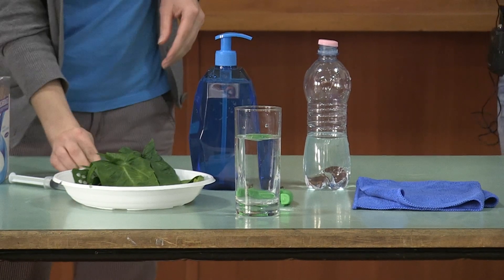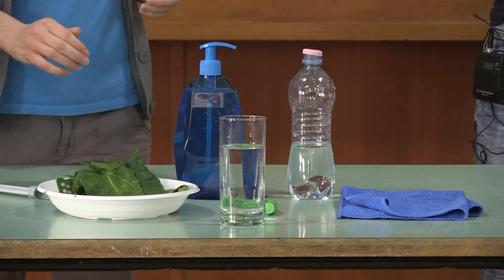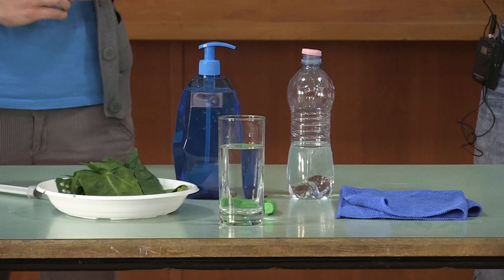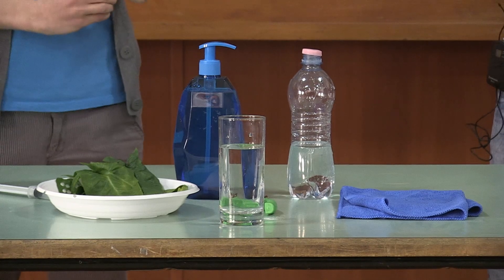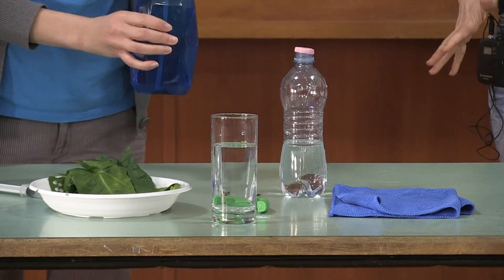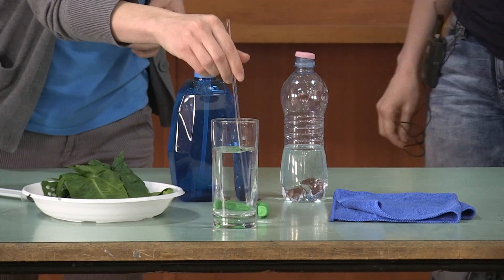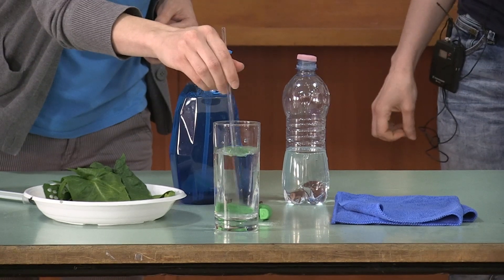Now we have to decrease the surface tension of the water so the leaves can sink. For this purpose we use the soap — just a tiny drop. Mix it a little bit. We don't need any bubbles.